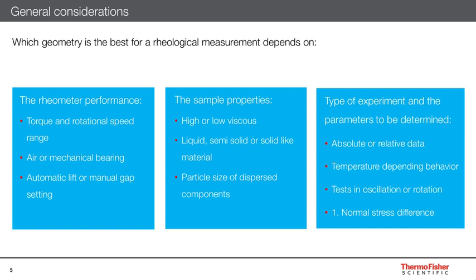The second factor is the properties of the sample to be tested. What is the viscosity and the consistency? Are there any particles dispersed? And if that's the case, what is the maximum particle size?